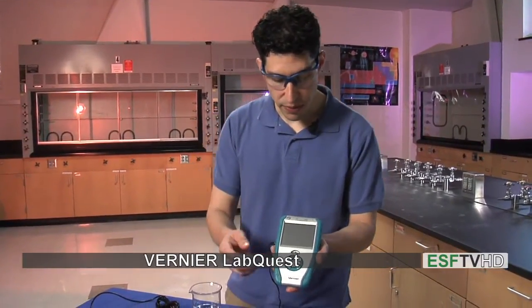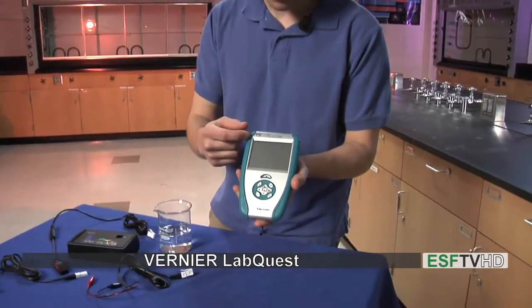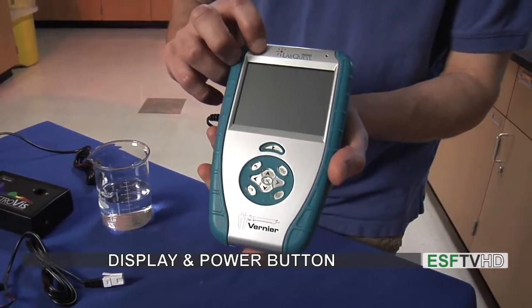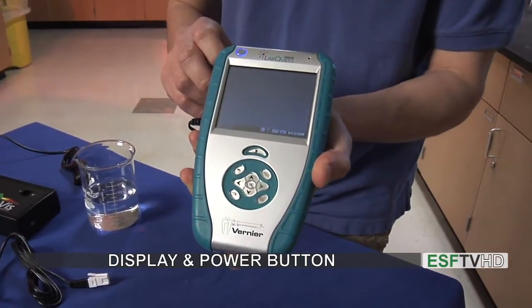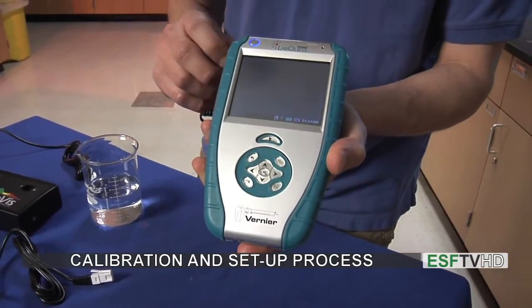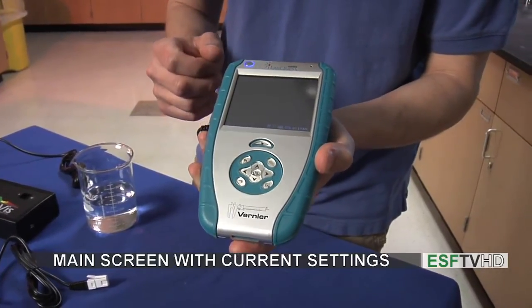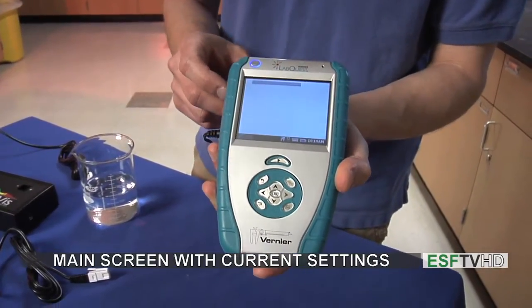So let's take a look at the LabQuest itself. The LabQuest is made of a few different parts. First we have a screen here. I'm going to power on by hitting the power button and it will go through a quick calibration setup. Once it gets to that main screen we'll see some new information.